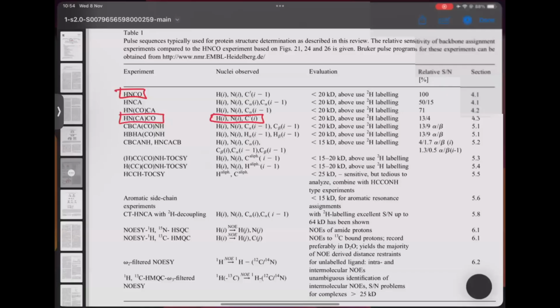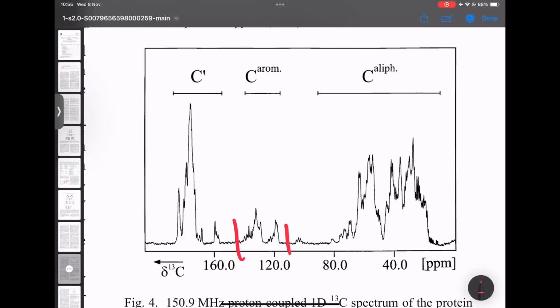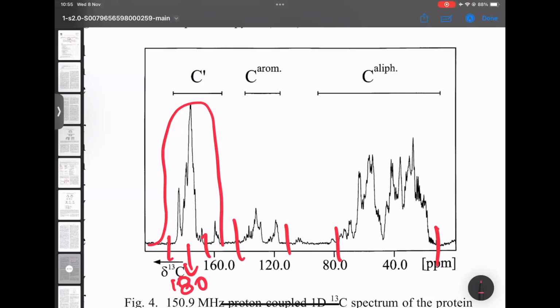The interesting aspect is that within a protein, the aromatic comes up here, the aliphatic carbon comes up here, and the carbonyl carbon comes up here. You can apply pulses which only excite specific portions. These are shaped pulses, which once again, unfortunately, I do not have time to do, or even off-resonance effects for rectangular pulses, which you can carefully tune, where only the carbonyl will get excited or inverted, while the C alpha remains in its equilibrium. You can do the opposite also.